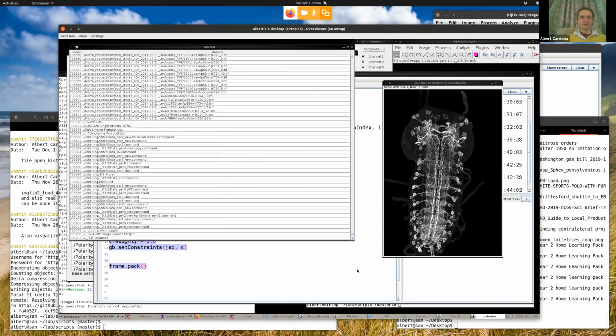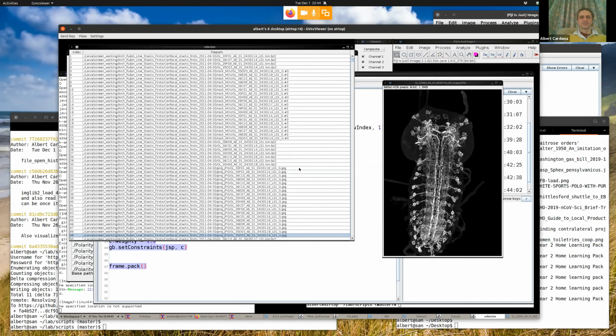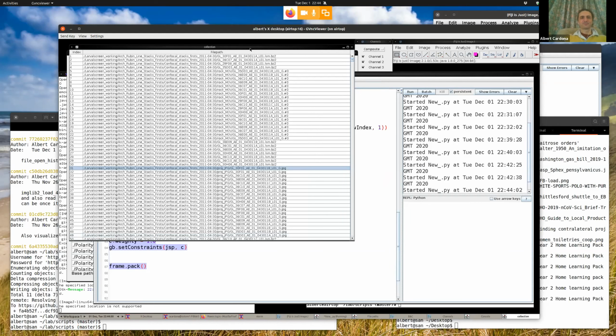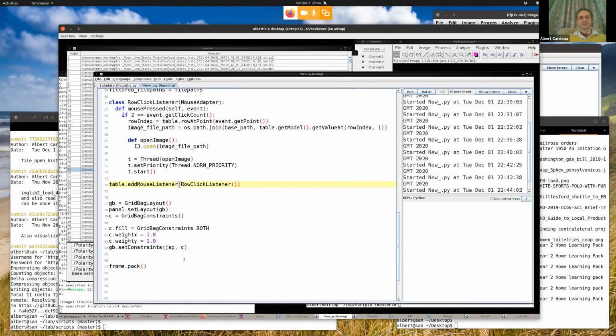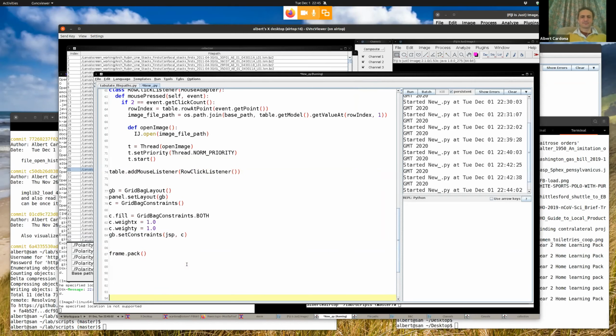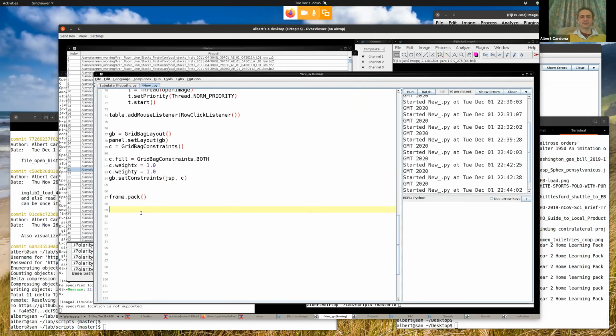And then every double click will open an image. And so that's great, except you're not going to look for files by scrolling through almost a million files, right? So what's the next step? The next step is we need a way to filter this, please. Great. So let's create a filter. And after we create a filter, we're done with this particular example.